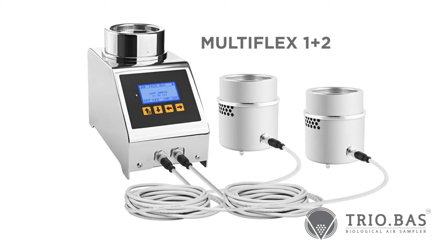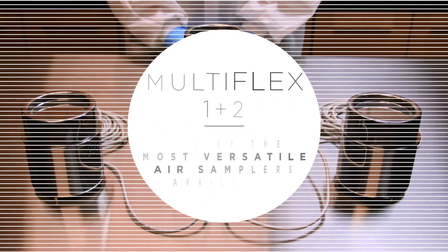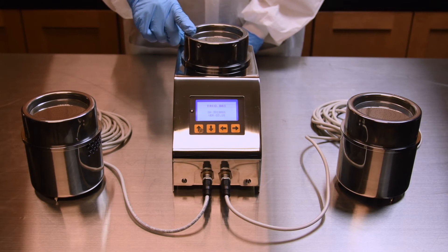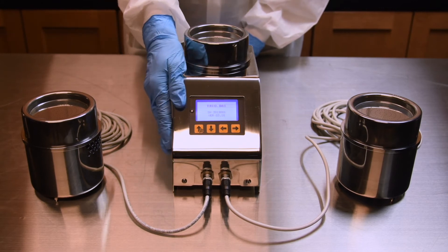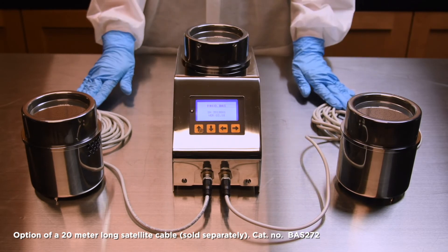Introducing the Multiflex 1 Plus 2 — one of the most versatile air samplers available. This design features one fixed aspirating chamber and command unit combination, plus two independent satellites with 5-meter-long attachment cables.